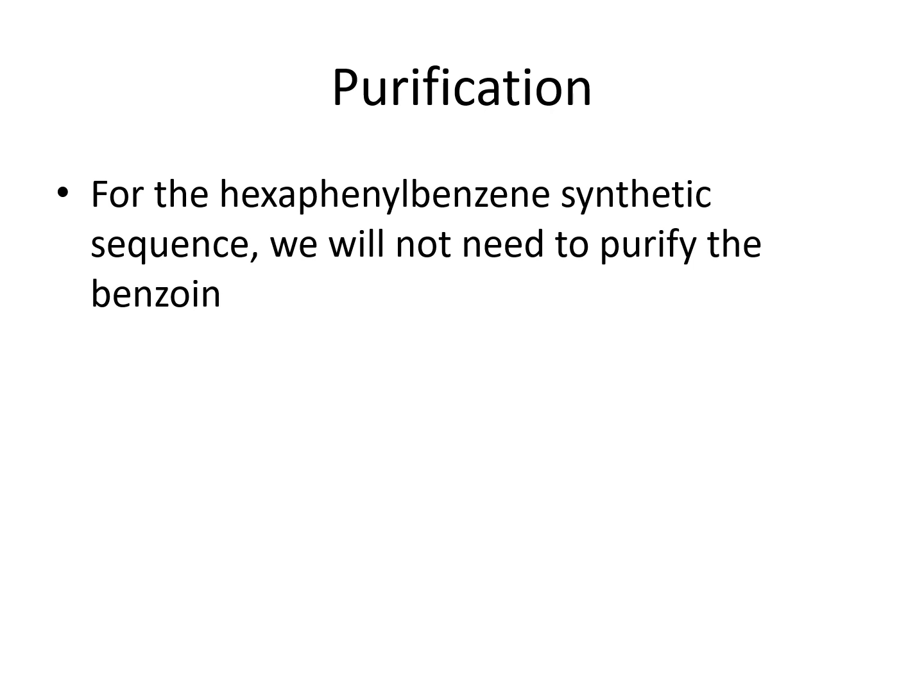And this benzoin will be used for the synthesis of the destination compound, but we don't need to further purify this one in the further synthesis of the hexaphenylbenzene.